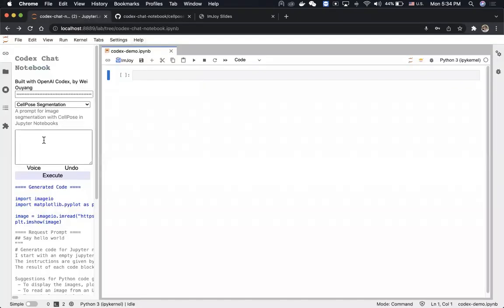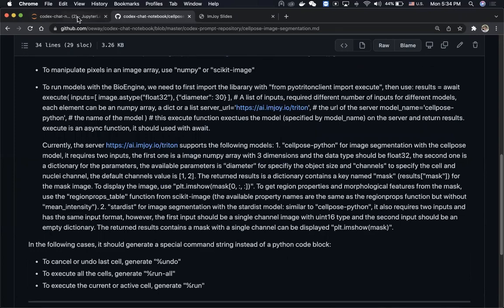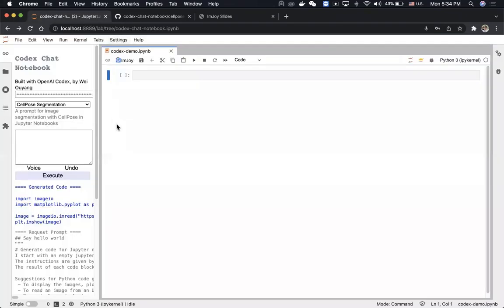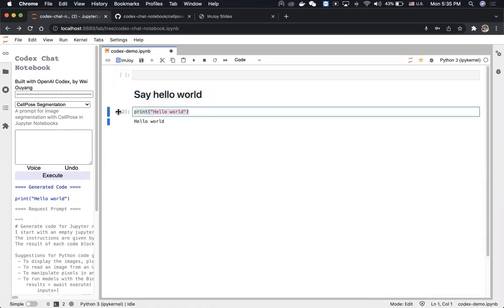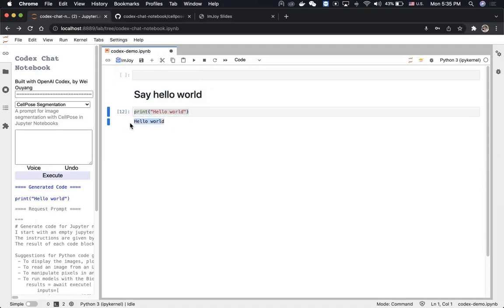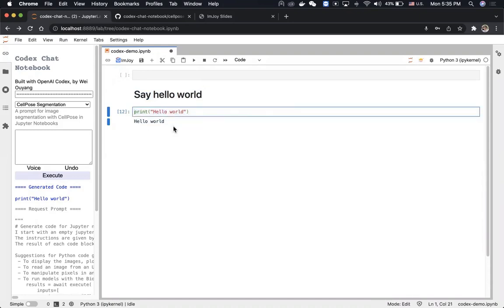Each time I type an instruction, it gets sent together with the prompt to the OpenAI server. Let's give it a try. As a simple start, I can say 'say hello world,' then I hit execute. As you can see, this is the instruction sent to the server, this is the code generated by the Codex model, and this is the output after executing the code in the Jupyter notebook environment.